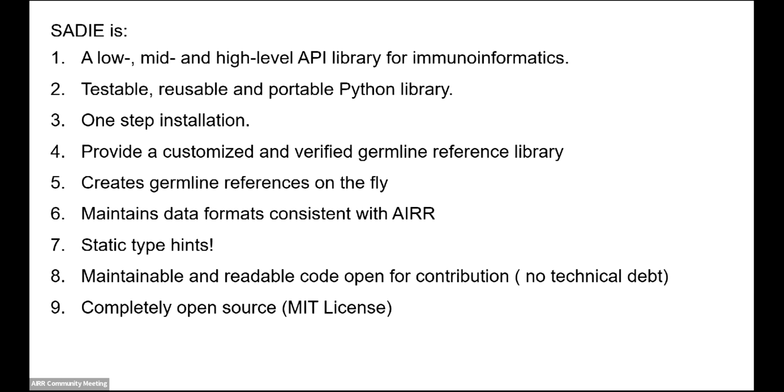But I do want to just mention we are in active development right now. About 30 days, we expect, version 1.0. And here's a list of our issues that we're trying to go through right now. Some of the major ones before we do a stable 1.0 release is we need our TCR sequences in there, and I know I lost half the room by just saying that. We want 100% code coverage. Everything is testable. We need a Windows and ARM build, and we want 100% documentation.